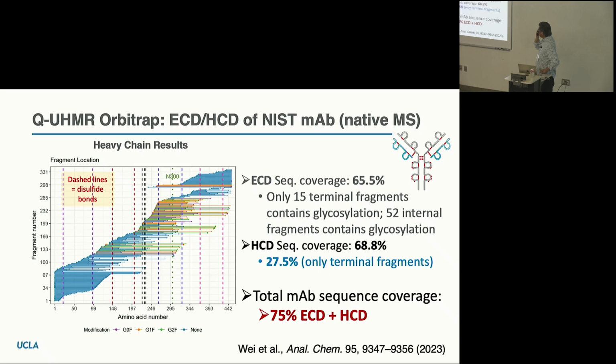But if I cut the protein using an enzyme, we call that middle-down mass spectrometry, just because we're making big pieces. So we cut it here, and it comes into 3 pieces now, and they're about 25 kilodaltons. It's a little bit smaller that way, a little bit easier to handle, a little bit easier to fragment. So that makes the fragmentation easier because you have smaller pieces. That's right. The nice thing about ECD, though, which I didn't say, is that there are 16 disulfide bonds in this protein, and ECD will cleave those disulfide bonds directly, so it's nice to combine that with ECD.